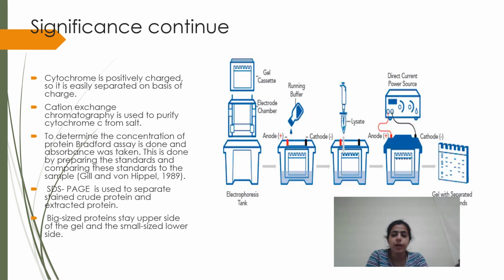First, the molecules bind in an appropriate way by creating the equilibrium in the exchanger buffer. That means for the exchanger buffer, we create the equilibrium. In that position, the molecules which are bound appropriately can be eluted in a very nice way. Second, the solute molecules have a charge opposite to the buffer, and due to that they can easily bind to the gel. That is also a second advantage for the extraction of the protein.